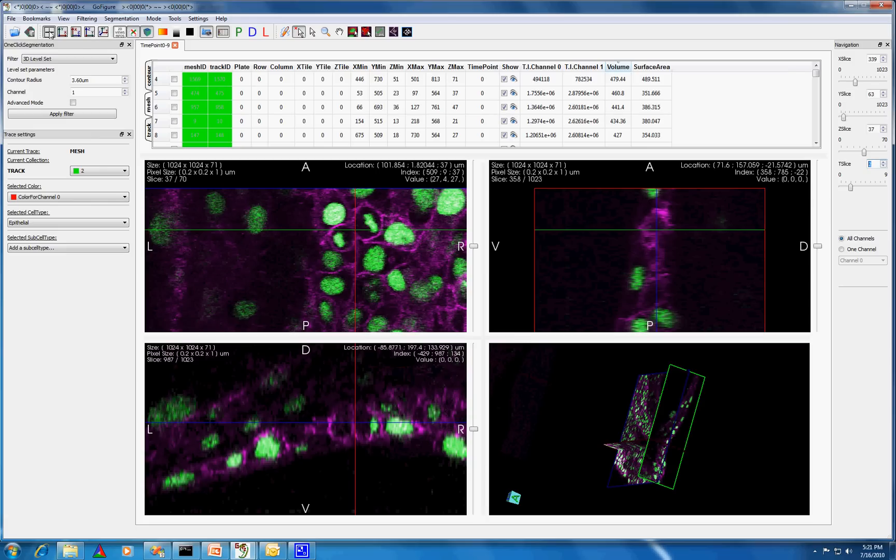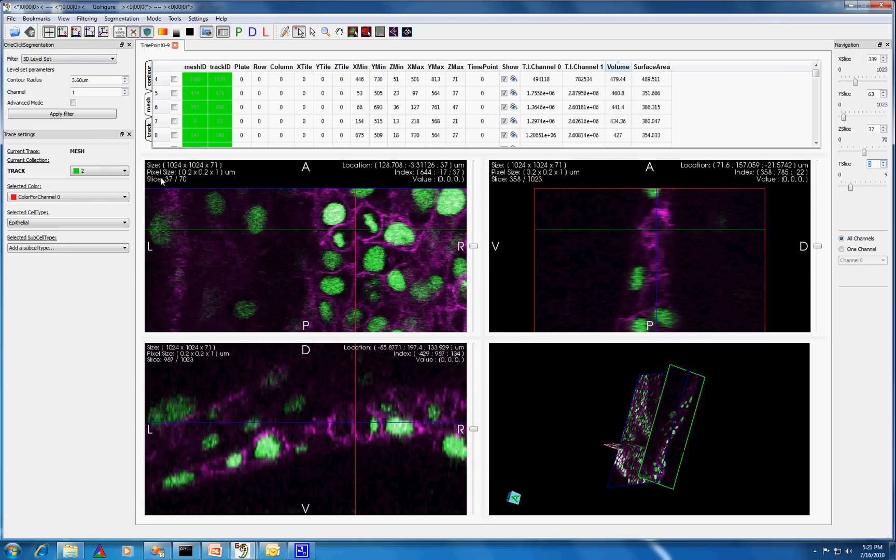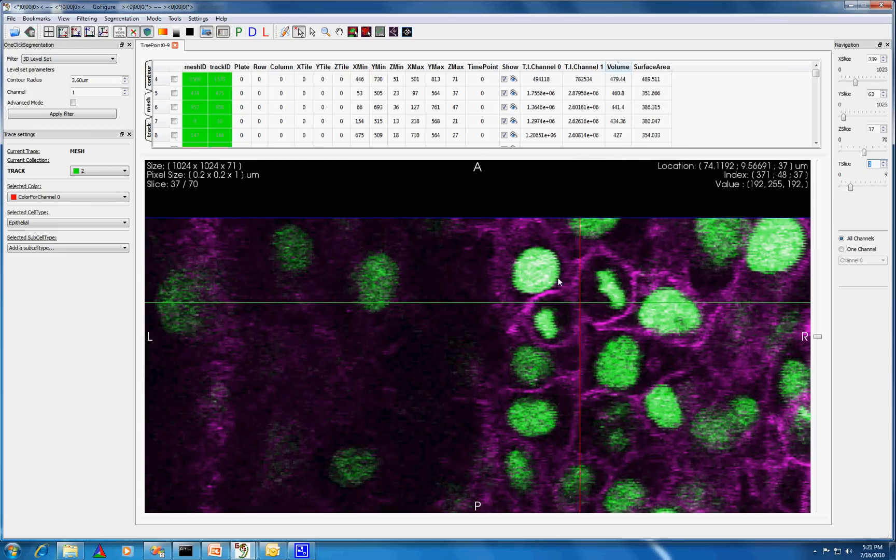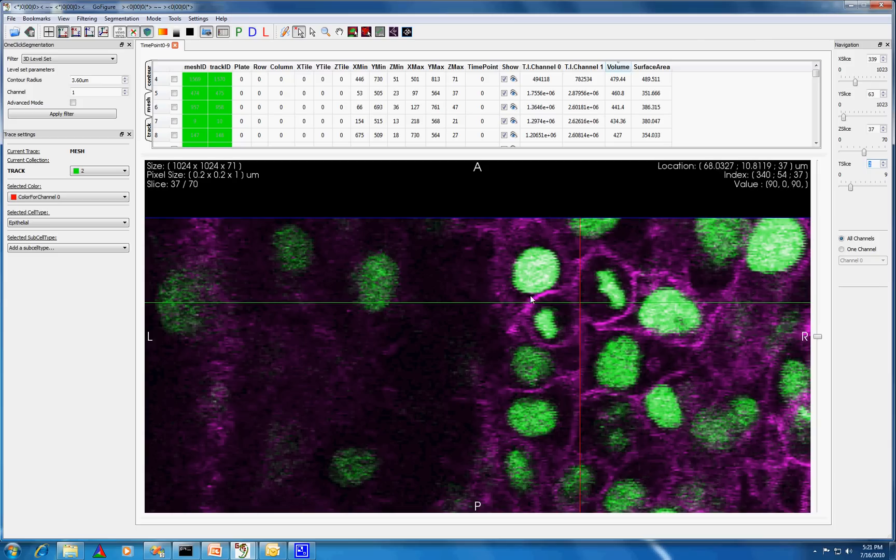At the previous time point, the cell was located at the current intersection of the different planes, so we can clearly see that the cell is dividing.